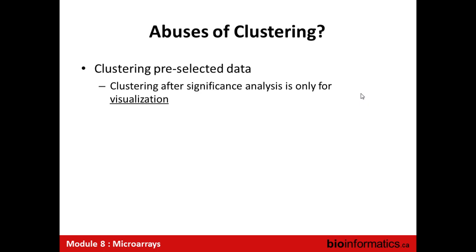And none of the genes will be statistically significant. And then they'll say, but those are the genes that I want. And these are fundamentally different endeavors. Clustering is not a replacement for statistical analysis. It can never be. In fact, it's less powered than statistical analysis will be. It doesn't give you assessments of p-values in the way that you'd like. It's just a way to visualize the data.